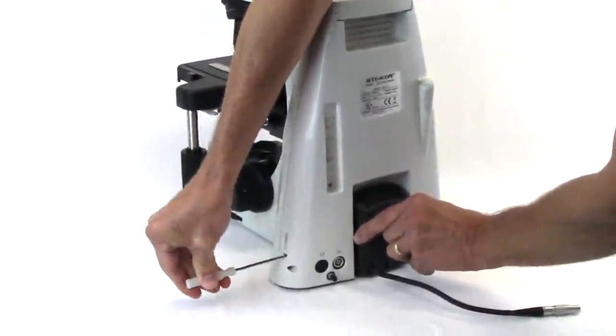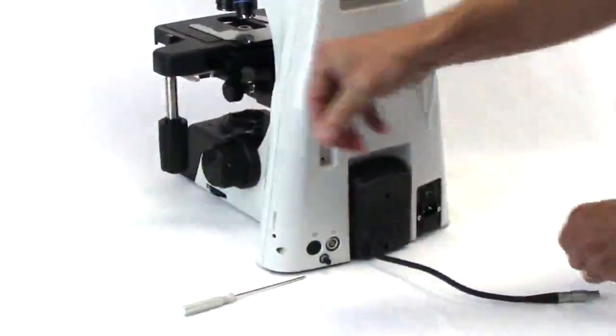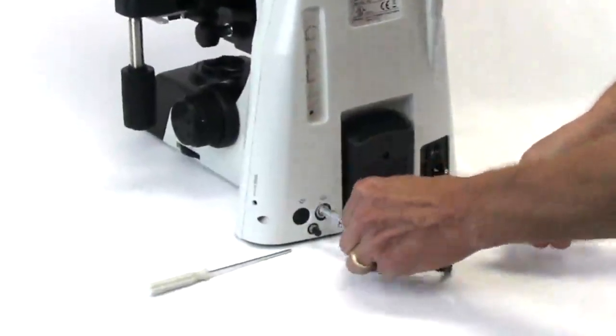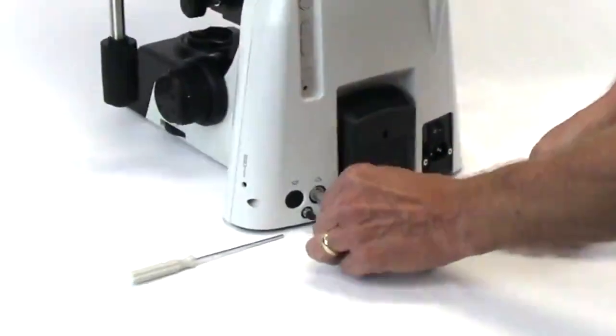Align the red dot on the LED lamp housing cable plug with the red dot on the top of the lamp house power port on the back of the microscope and slide the plug into the port.